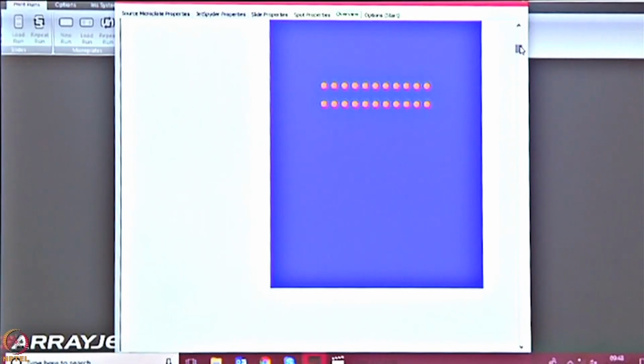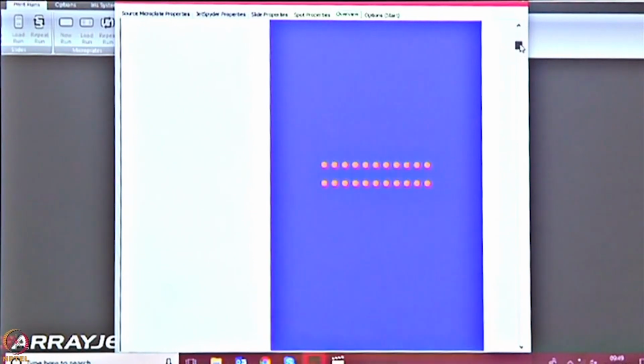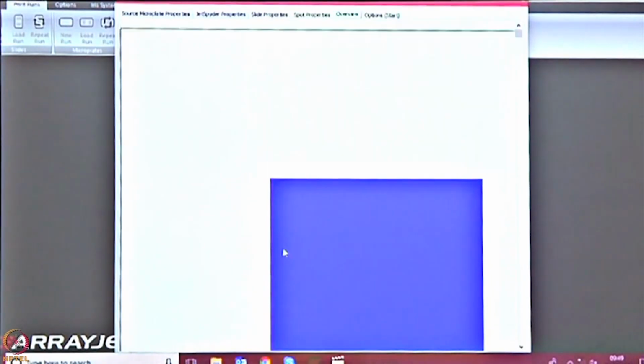So this is your one square. And now I have designed it, just while talking, in such a way that it looks pretty. It's good morphology and differentiated spots. So now you can tell that yes, this is something that I can work with, I can develop my assay. There could be many other biological samples that you can get in this square. So this is just one. So let me go out of it.